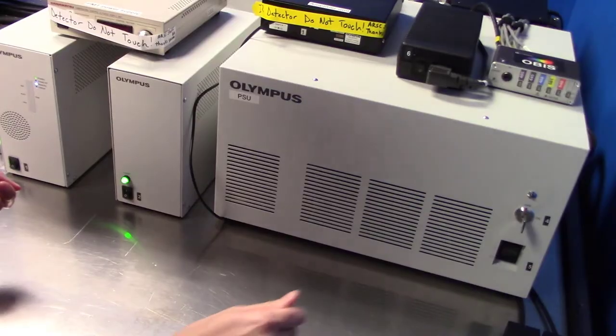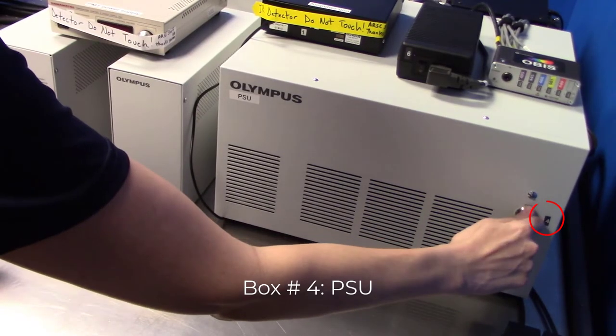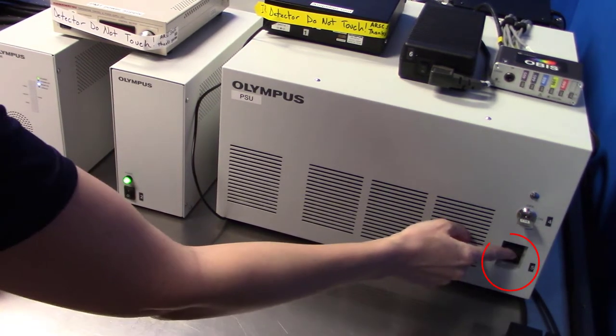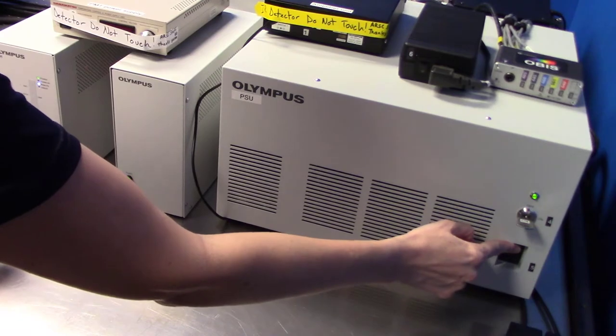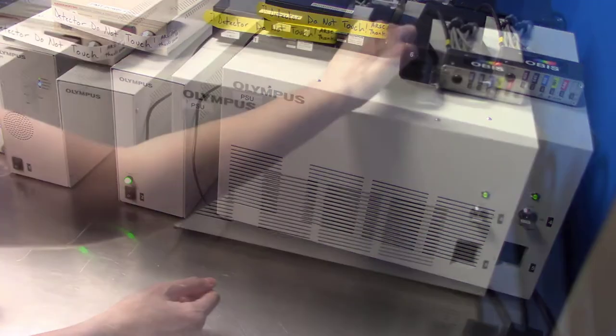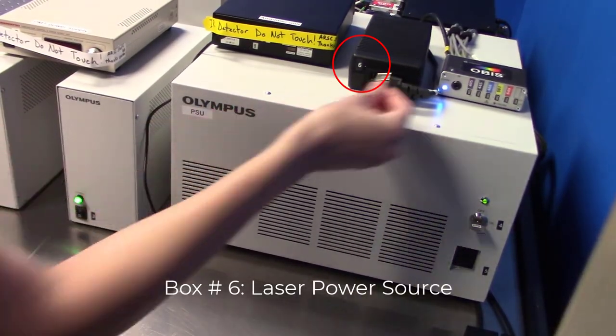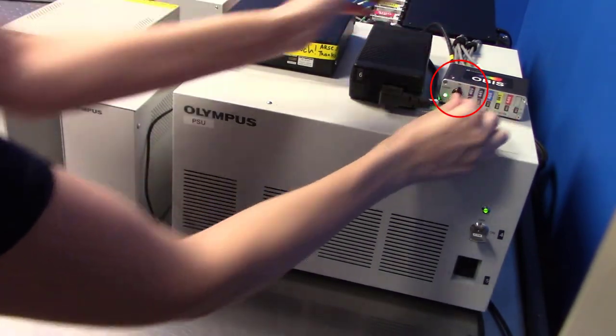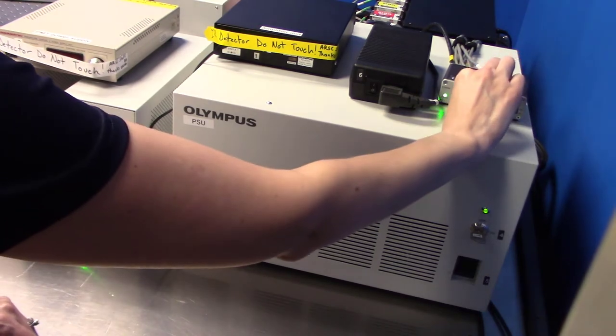Obtain the key and insert into position number 4, the PSU, and turn the key to the on position. Turn on number 5 and wait for the mirrors to cycle before continuing. Turn on box number 6, the laser power source. Insert key into position 7 and turn on the lasers by flipping up each laser's tab.